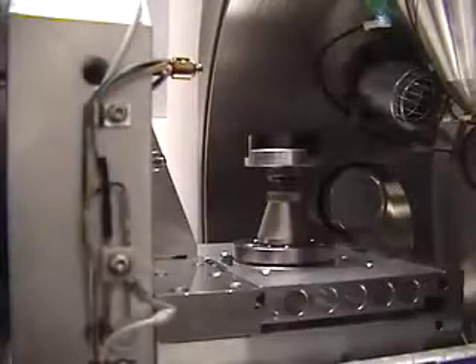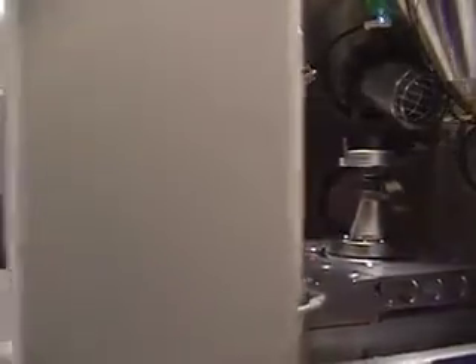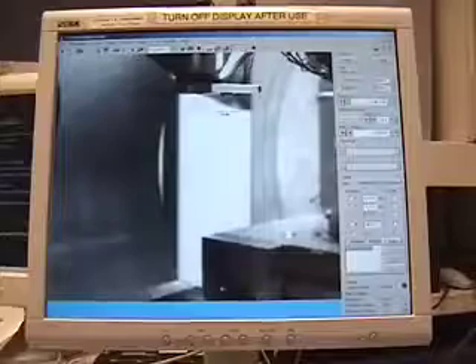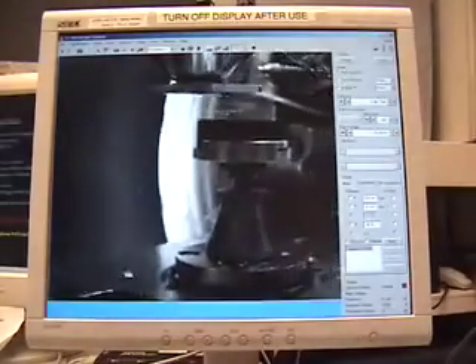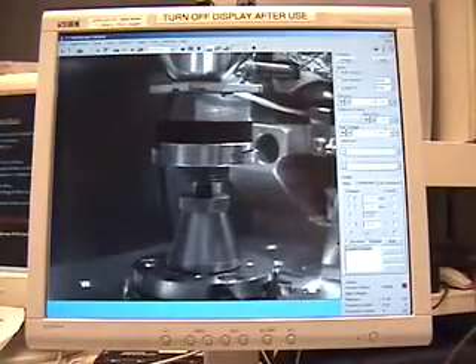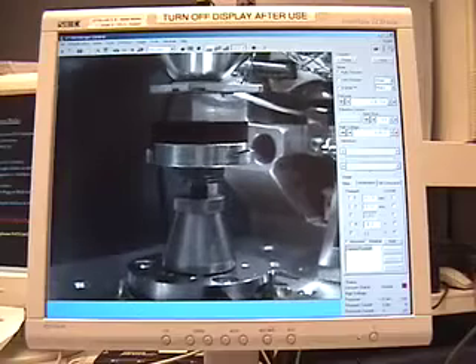Watch the specimen pass under the backscatter detector as the specimen door is closed. It is also a good idea to use the television camera inside the specimen chamber to make sure that there are no obstructions when you close the door.